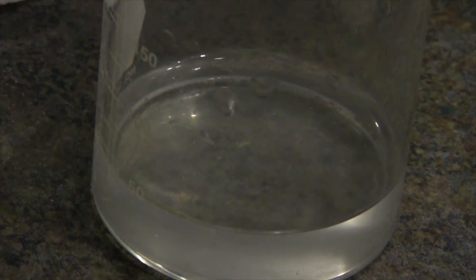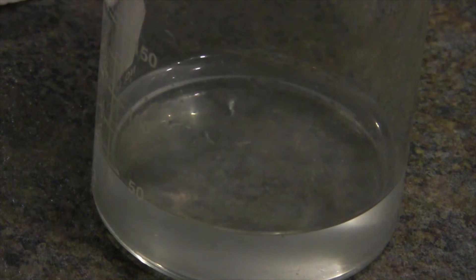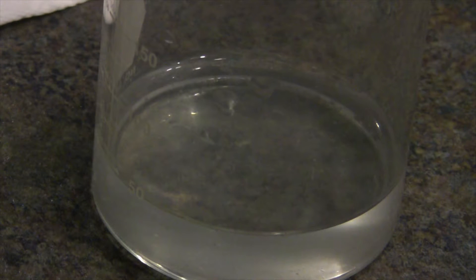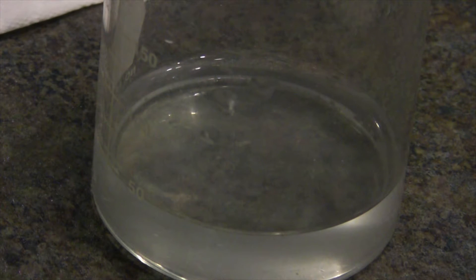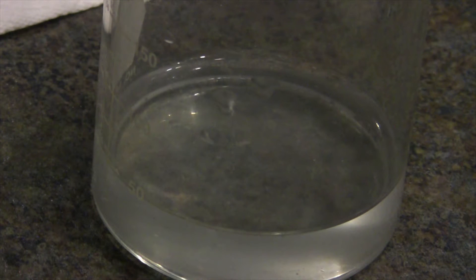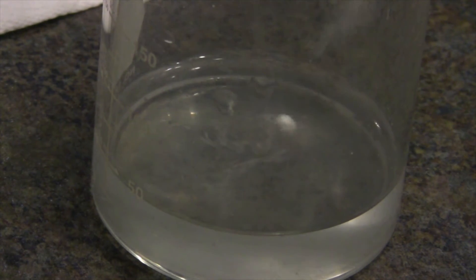Alright, now shall we try for a slightly larger piece? I think we will. Just a slightly larger piece — maybe we'll see some sparks. So now we have a slightly larger chunk of sodium, and here it goes into the hydrochloric acid solution. There we go.